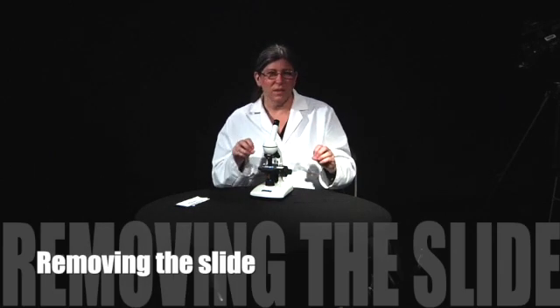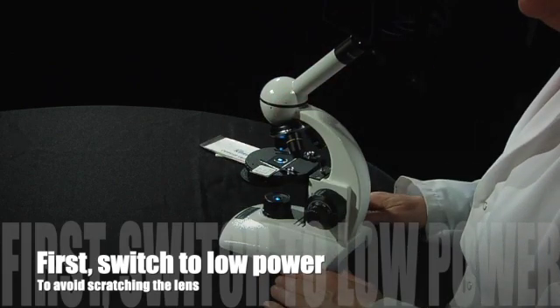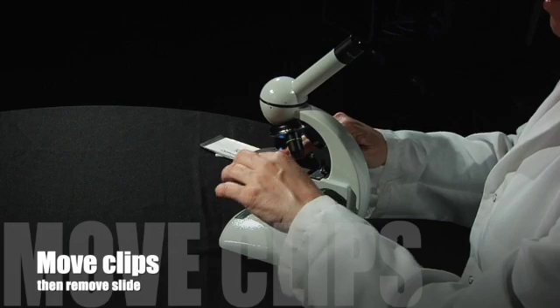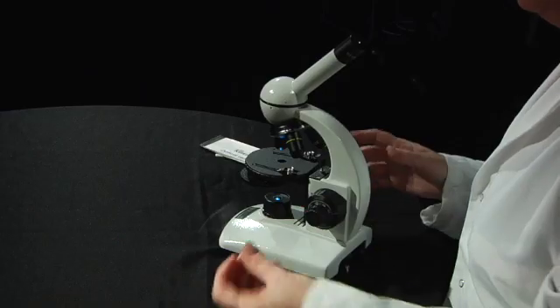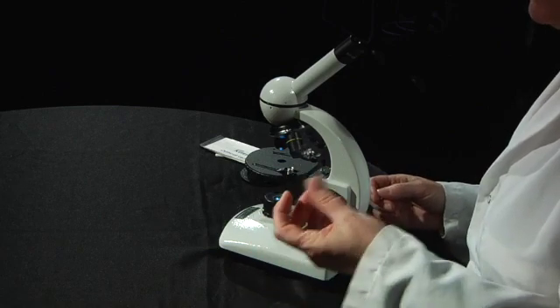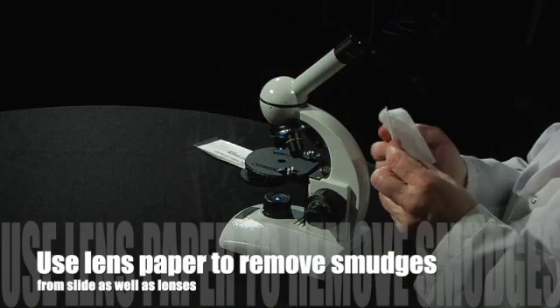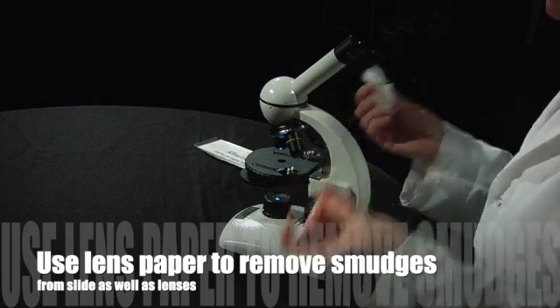The next thing we're going to do is take the slide off. Before you do that, you need to be on low power, so keep rotating the nosepiece until you're on low power. Then you can remove the clips and take the slide off. Tuck those clips back in for safety so you don't break them. If you noticed any fingerprints on the slide, you can use the same Kim wipe or lens paper that you used earlier to clean the slide as well as the microscope.